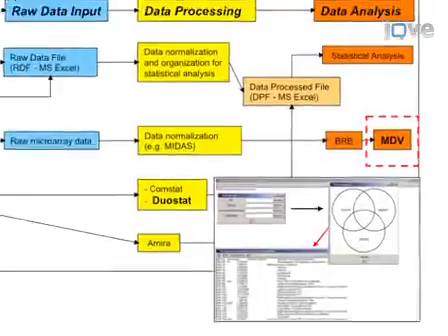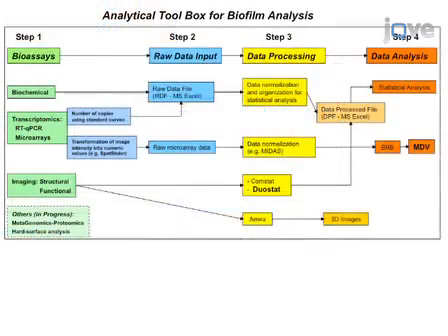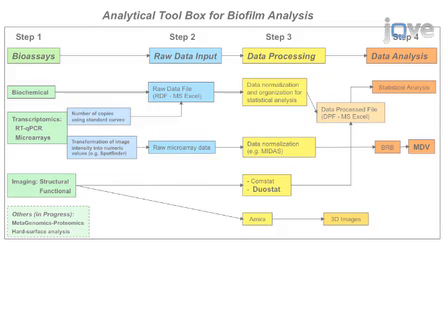The final step is to analyze the processed data, including the use of microarray data mining and organization software Microarray Data Visualizer, or MDV. Ultimately, results can be obtained that show how oral pathogens change their transcriptome and the architecture of the biofilms in response to complex diet-host microbial interactions using our uniquely integrated analytical toolbox, providing a more comprehensive biofilm analysis and data interpretation.